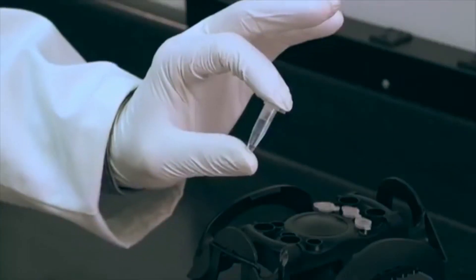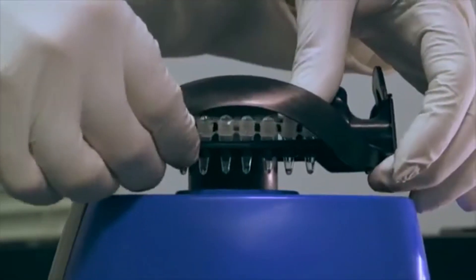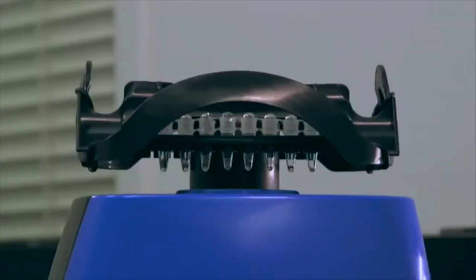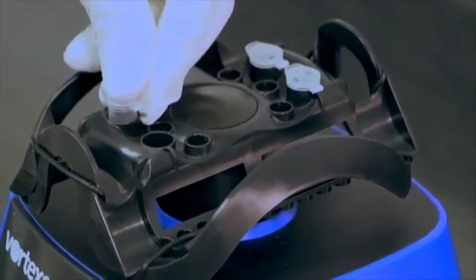Changing heads can cost you valuable time and money when constantly switching sample vessels. But with the Vortexer, the head stays on and researchers can perform several applications in a single mixing platform.